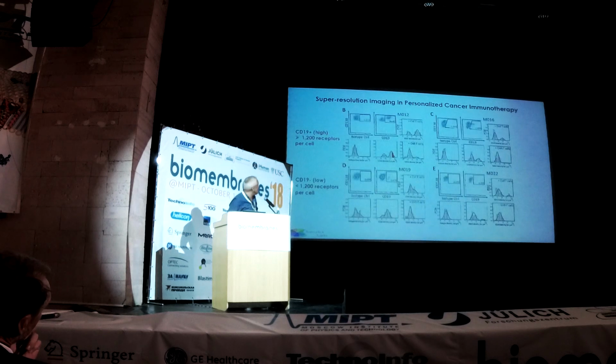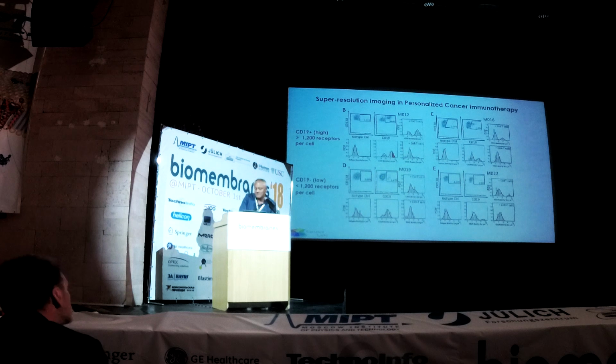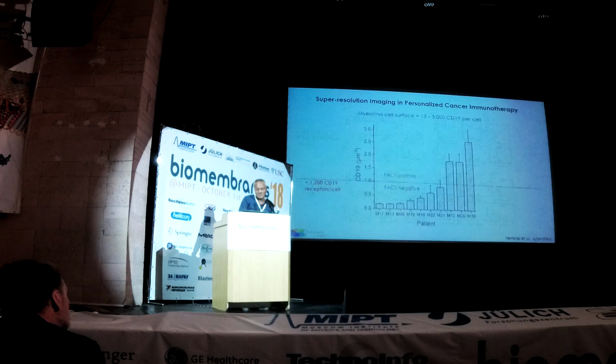A lot of statistics with flow cytometry data and dSTORM data. For example, for a high expressor here, which is really also in flow cytometry, 20% of the cells are positive, so from time to time you find these patients. But most of them, even though they are positive, are negative in flow cytometry. And for other cases, like this patient, this population disappears completely after CAR T cell treatment as well, which convinces us that this was really CD19 expression on this multiple myeloma cell.